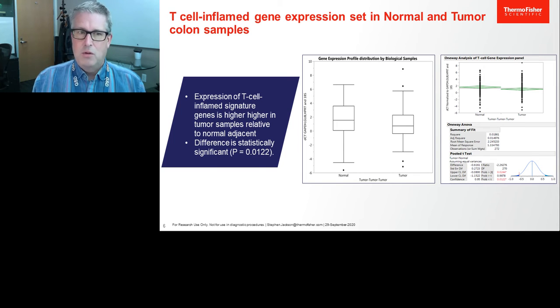Here you can see that the overall signature of the genes, not every gene, but the signature in general, was upregulated, reflecting its lower CT score. These genes were upregulated in the tumor cells versus the normal cells. So no real surprise there. We'd expect some of the tumor genes to be responsive to PD-L1.